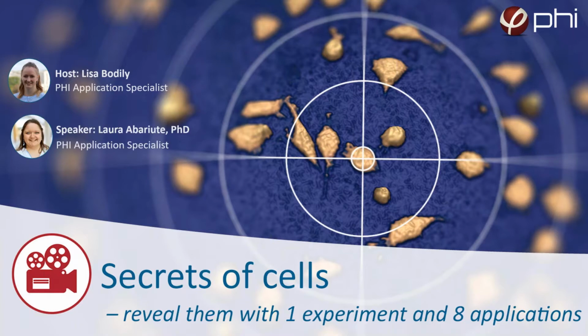And during today's webinar, my colleague Laura is going to present how you can reveal your cell's secrets by performing one experiment using our HoloMonitor M4 technology and analyzing your data with our AppSuite software applications. If you have any questions, please ask them anytime using the chat function, and we will answer them in our Q&A at the end. Let's get started.